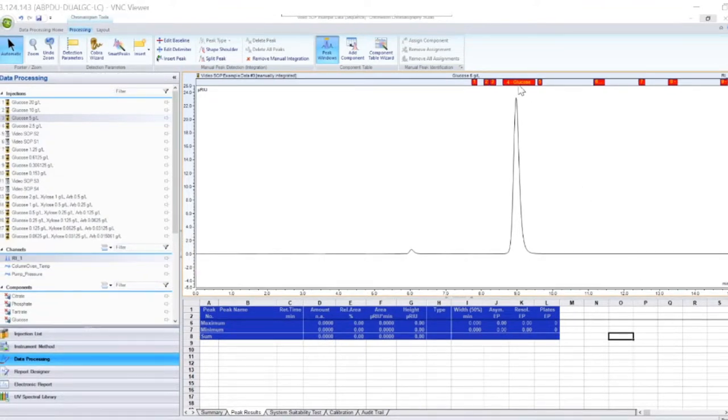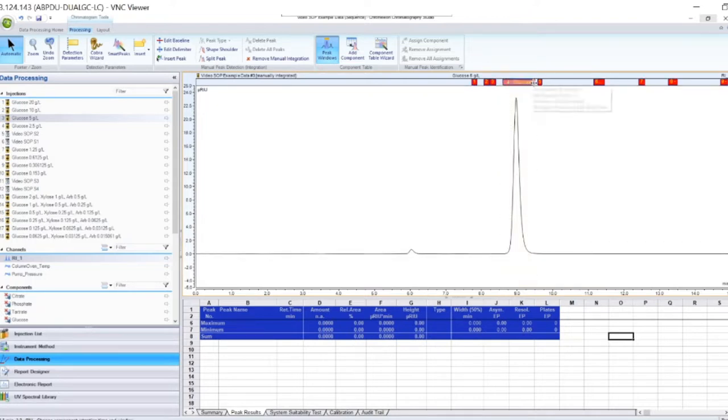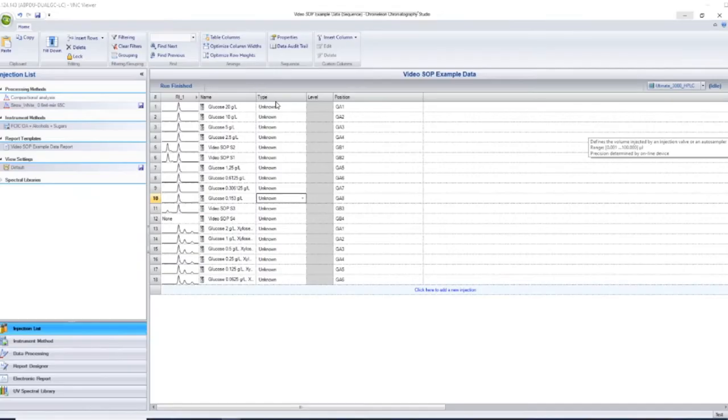Finally, you can update the retention times by clicking and dragging the peak window on the chromatogram. Grab one of the delimiters to extend or narrow the peak window.